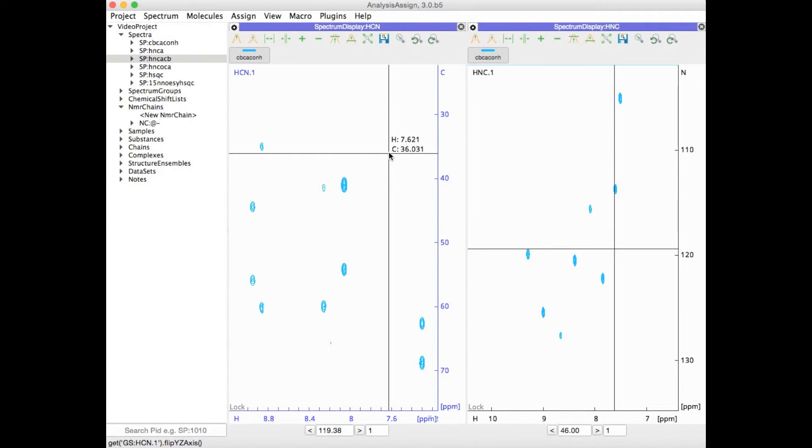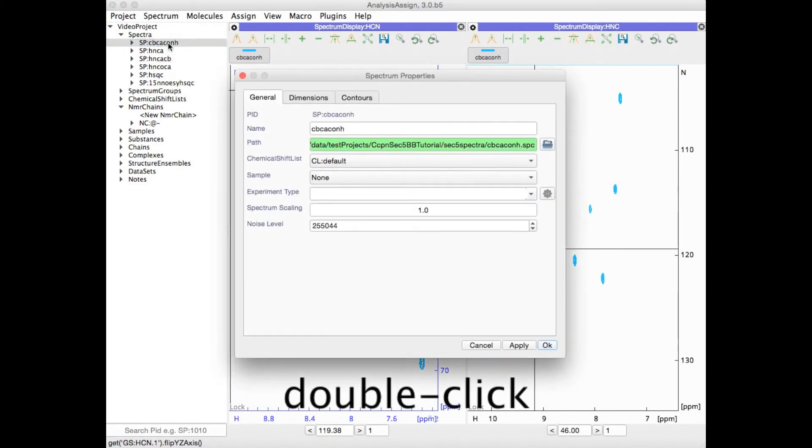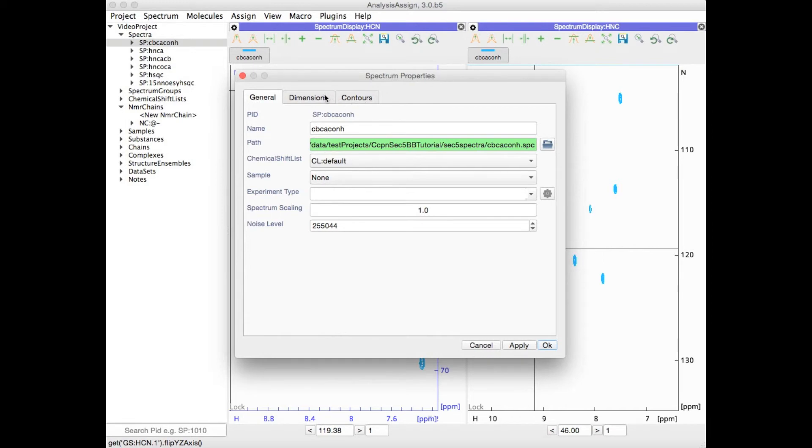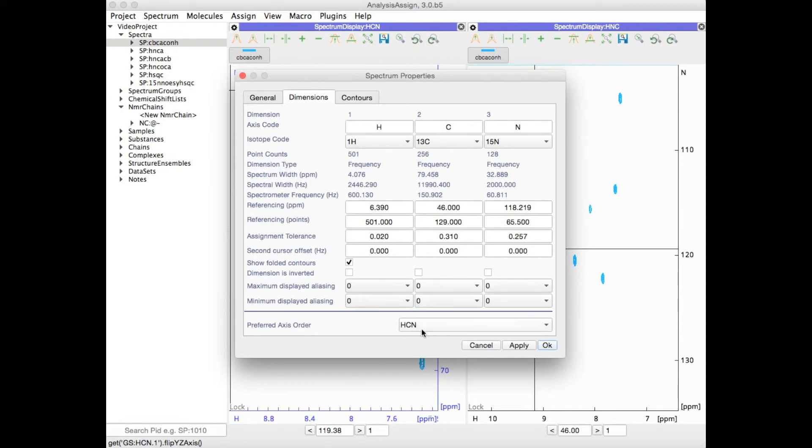If you want to change the default axis arrangement for a spectrum, simply double-click on that spectrum to bring up the spectrum properties dialog box. Go to the Dimensions tab where you have a list of all your different dimensions.